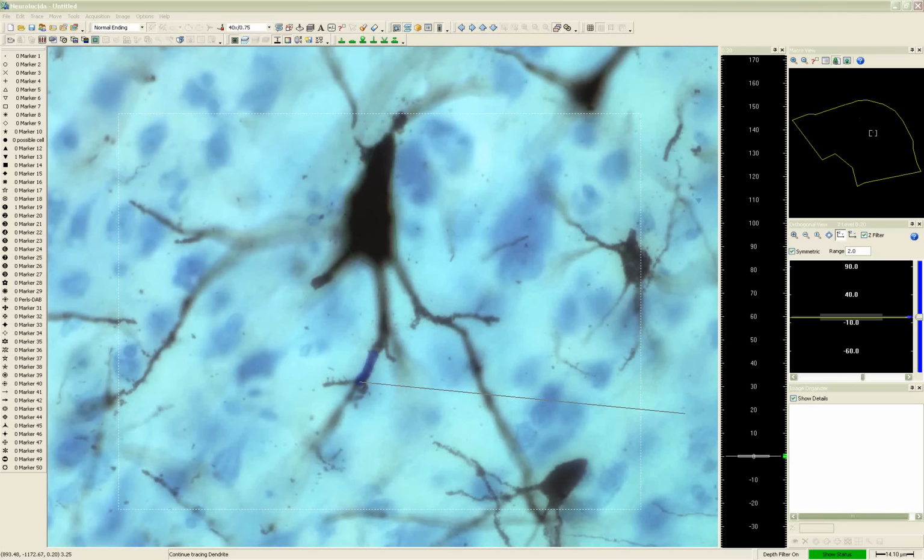Kaylin asks about the best way of finding the point of reference. From my own experience, personally, I like to place the reference point in a place that makes sense to me for my reconstruction. I always tend to pick the longitudinal fissure if it's available, so the midpoint where the corpus callosum is. That seems to work for me.